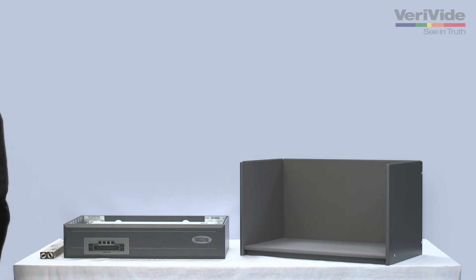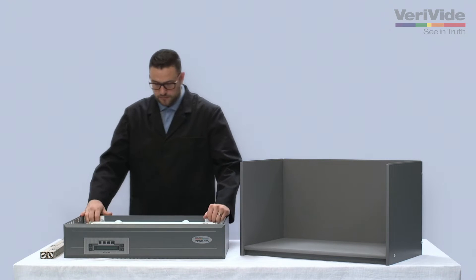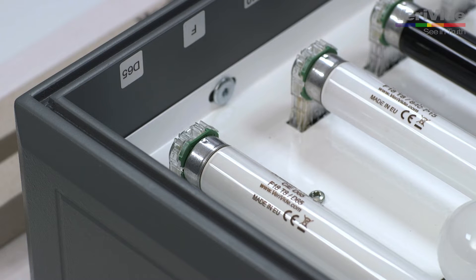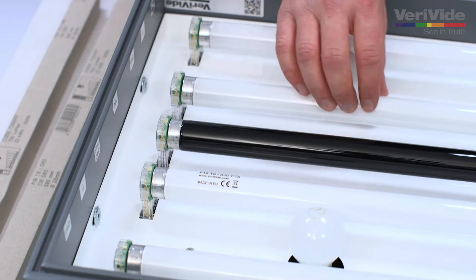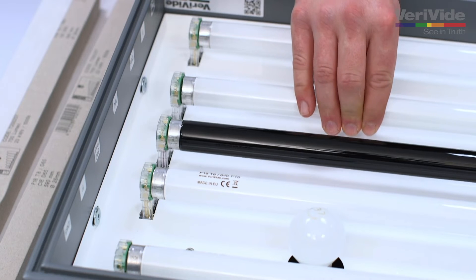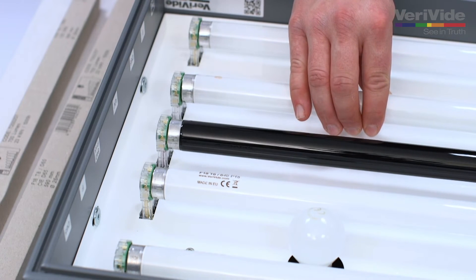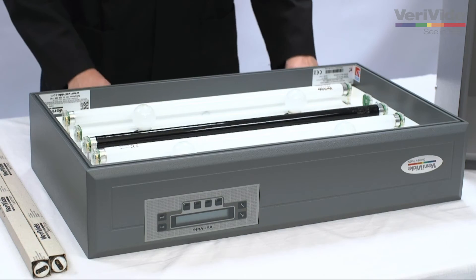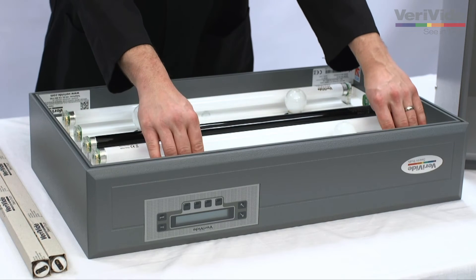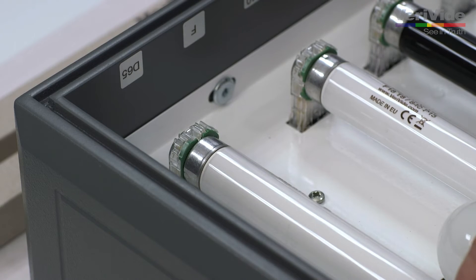For larger cabinets, the help of another person will be required. Once this step is completed, locate the Verivide CIE D65 bulbs using the stickers located on the cabinet interior. All daylight and point of sale lamps come as a pair. Once the bulbs are located, ensuring the lamp is cool and using both hands, twist the first Verivide CIE D65 lamp 90 degrees clockwise or counterclockwise to free it from its housing. Safely withdraw the lamp from the unit and set it to one side. Repeat this step for the second lamp.